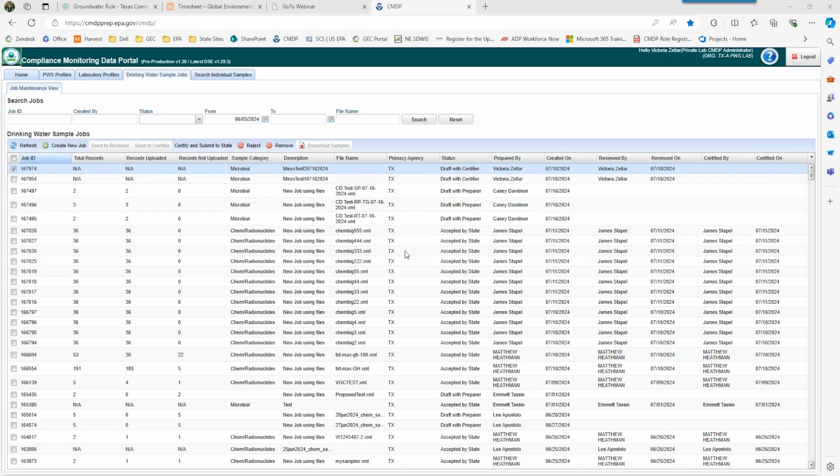All right. Oh, my questions just reset themselves to the beginning. Give me a moment. You guys are asking really great questions too. Can there be more than one admin? Yes, there should be more than one admin, just in case the lab admin is out or on vacation.